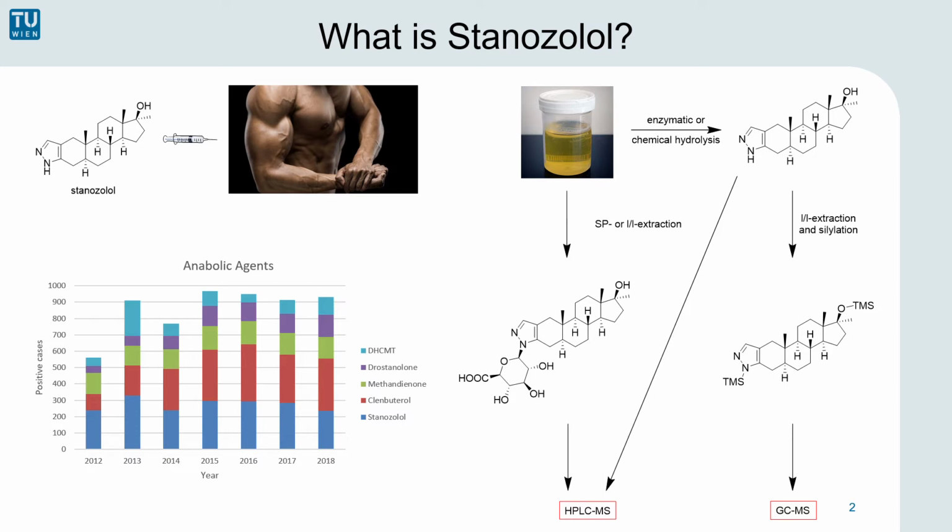What is stanozolol? Stanozolol is the molecule on the left side and is a synthetic, anabolic, androgenic steroid which enhances muscle growth. It is the most often detected anabolic steroid in professional sports, and therefore the analysis and identification of its metabolites is essential for anti-doping analysis.